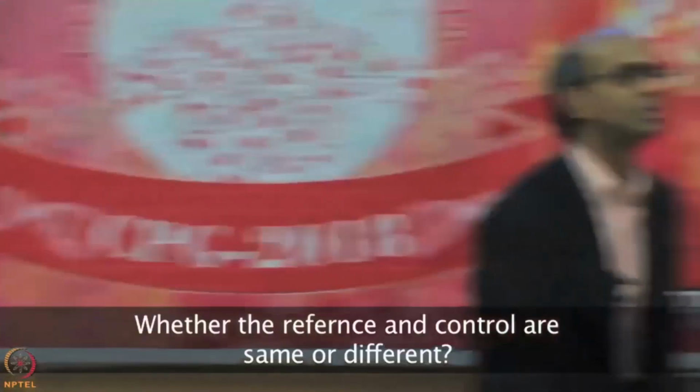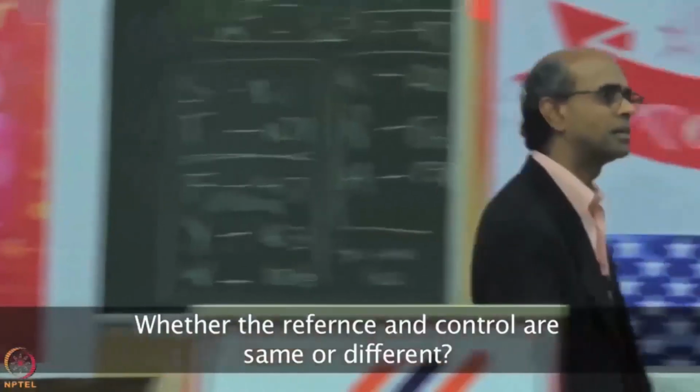So I have one basic question. The reference is the same as a control? No. The reference is basically a sample we have to make sure is the same in every TMT 10-plex, so that if there are differences, we can make this thing the same to normalize things across. And yes, if you had a control or a normal sample, that would also be compared to the reference.